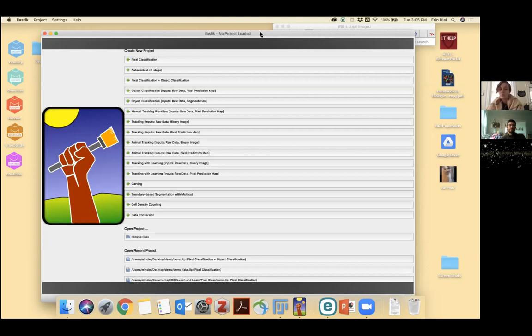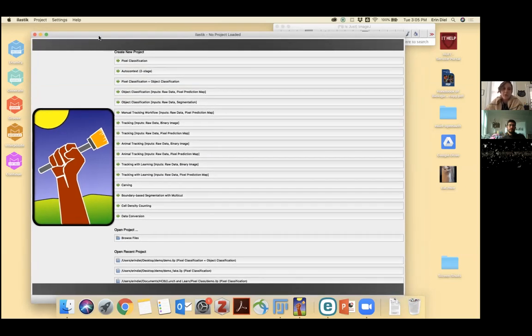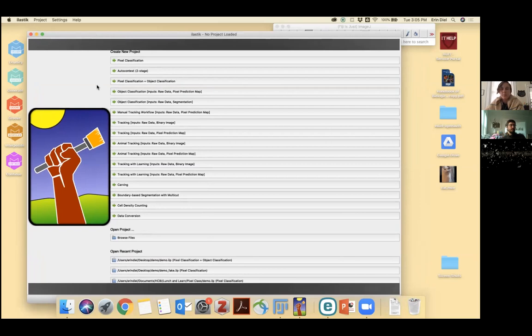The two examples that I'll show today are not necessarily the only places where you can apply machine learning in your image processing. But hopefully they're helpful to get you started. The first thing that I wanted to show you is a standalone software called Ilastik.